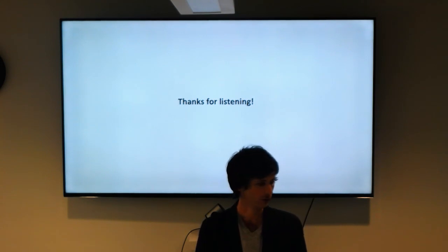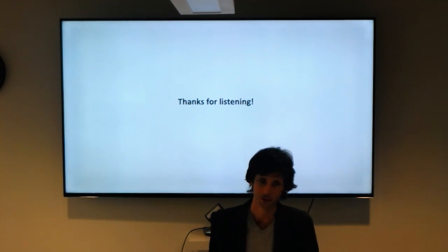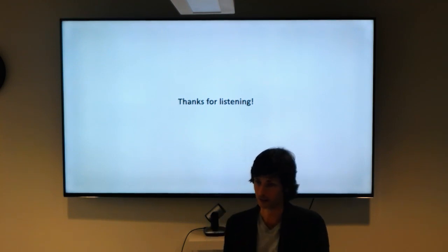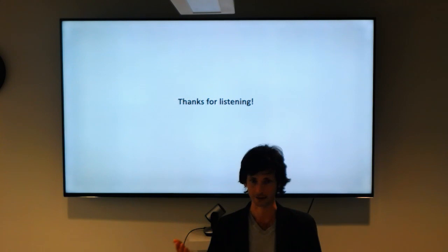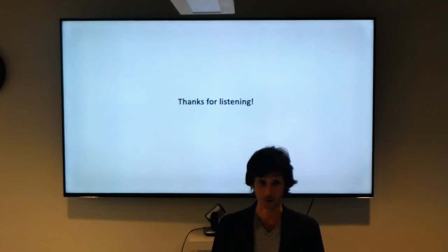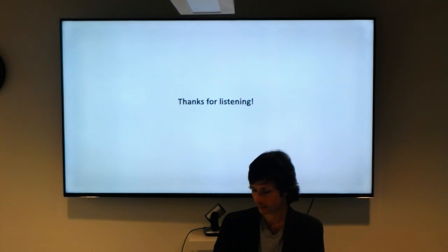Doesn't COOT have a tutorial? COOT does have a tutorial, but it's very high resolution. At which point that's useful for understanding the basics of how to use the program, but it doesn't tell you how to use the program with your shitty data, which is what you really want to know, right? Sure. Okay.